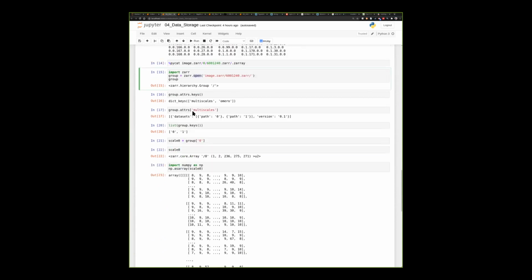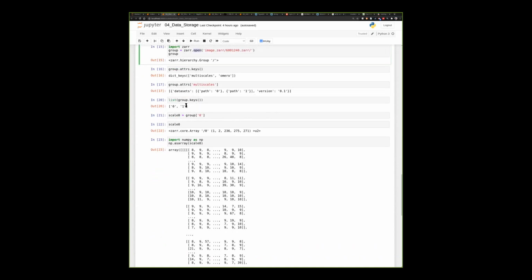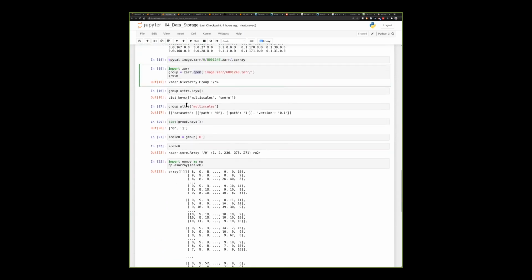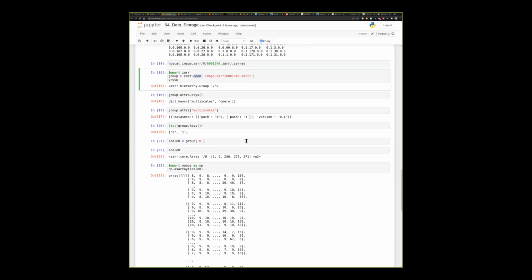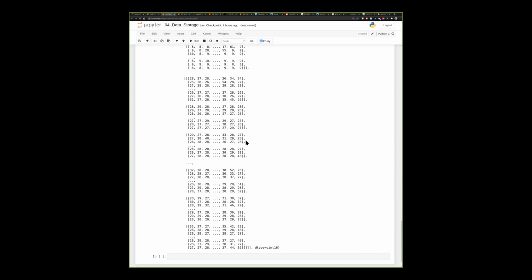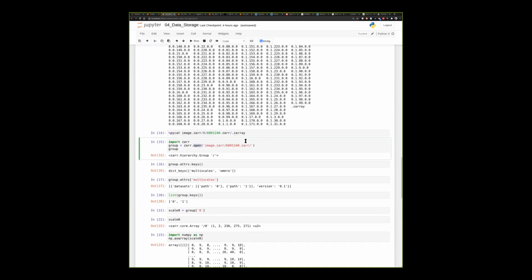When you look at the interface in the ZAR library, one thing to keep an eye out for is that things are lazy. This idea of laziness means that we can get metadata, a description of the data, but we don't actually get the bulk data, the pixel data, until we do an operation that requires us to actually read that data, which is important for very large images when we don't want to run out of memory, and for parallel computation.